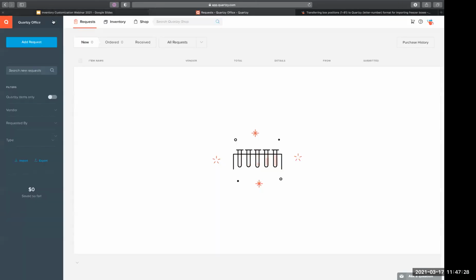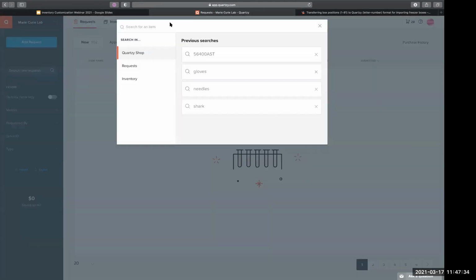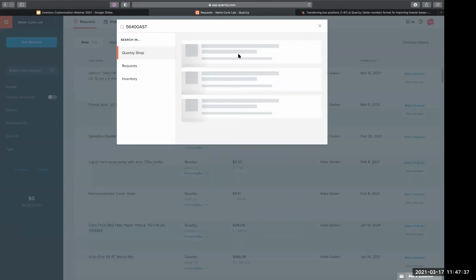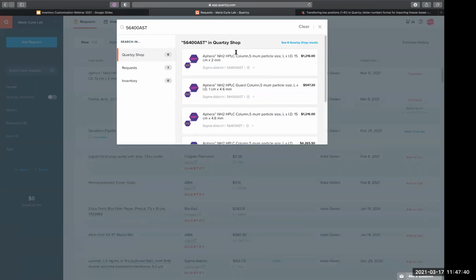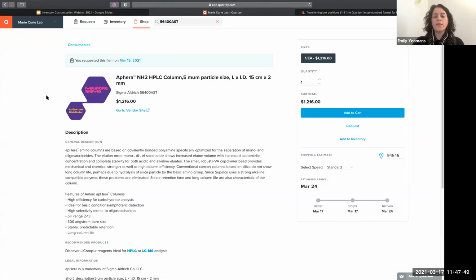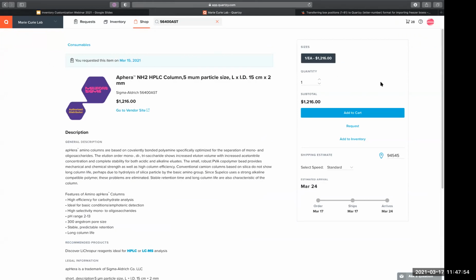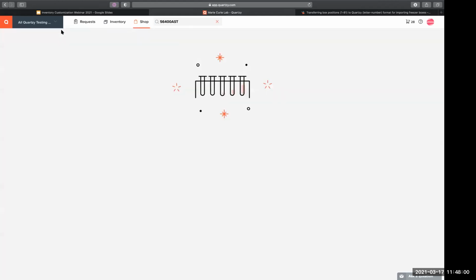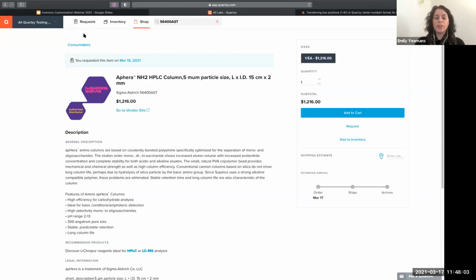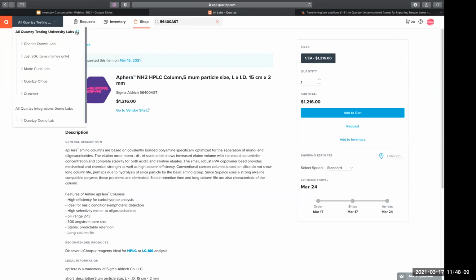Yeah, I can definitely give you a little preview here. And then Katie, after you show this, can you talk about the permissions of who can and can't modify fields? Yeah, absolutely. So this is our new product pages here, not been released yet. It's much wider, holds a lot more information. Yes, it's very detailed, and Chloe will probably go over that more in her webinar as well.